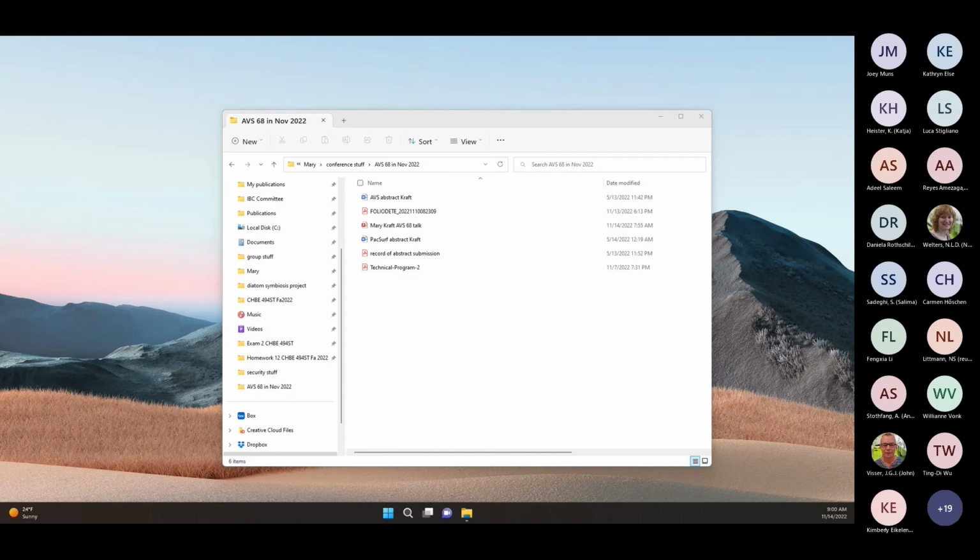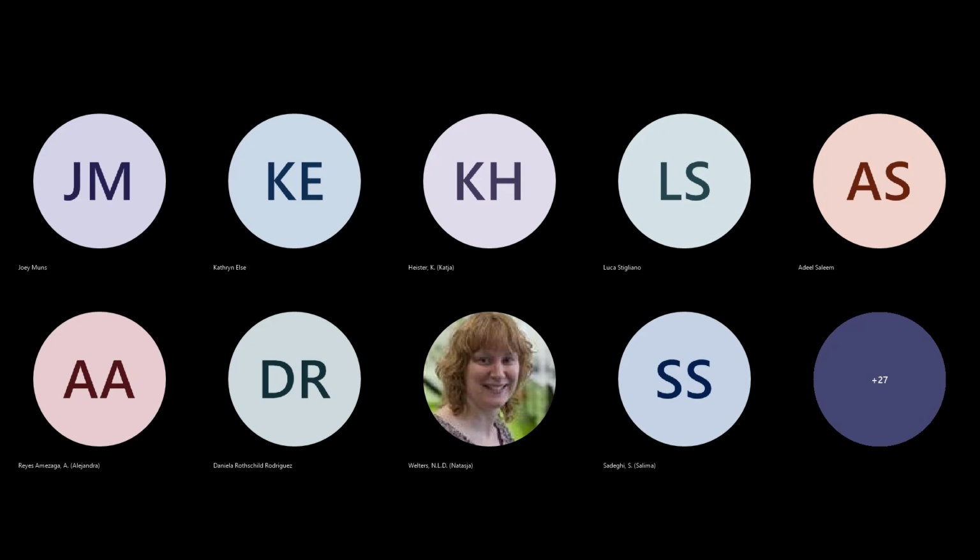Okay. Thank you. Then another question. Why did you choose iridium to coat your samples? That's the question I also had. Like normally we use gold or... So when we did this, the bottom line is it was happenstance initially.